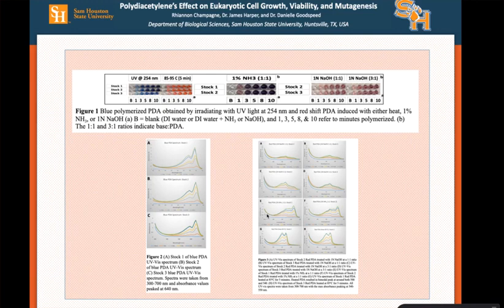For the ammonia, the 1% ammonia, you could see an even higher absorbance peaking at these particular wavelengths, and that was most likely due to the deeper red color that you see here. And then our thermochromic trials, where we expose them to 85 to 95 degrees Celsius, they were actually bimodal peaks at 500 and 540 respectively, but it was a very large increase in absorbance.